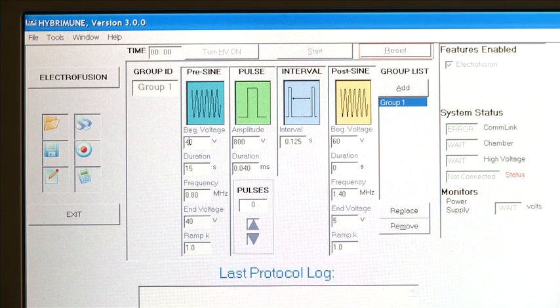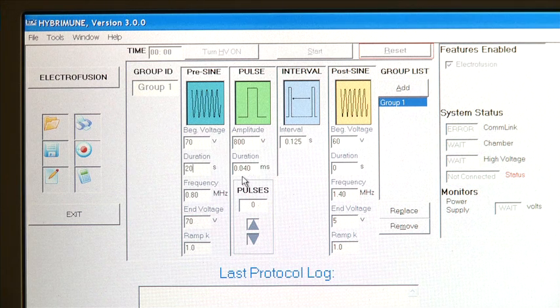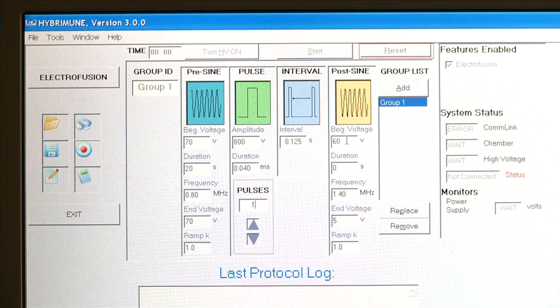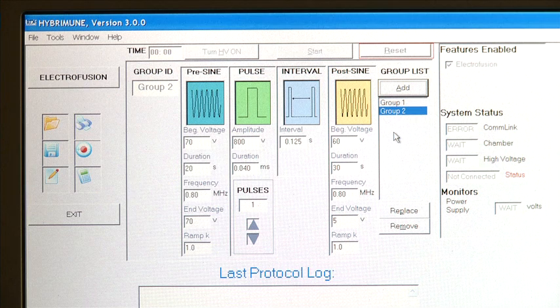Program the second group by setting the pre-sign beginning voltage to 70 volts and the pre-sign end voltage to 70 volts, with a pulse duration of 20 seconds. Set the high voltage pulse to 800 volts, a pulse duration of 40 microseconds with a pulse number of 1. Set the post-sign voltage to 5 volts with a pulse duration of 30 seconds and a frequency of 0.8 MHz. Then click Add under Group List to add these settings as Group 2.